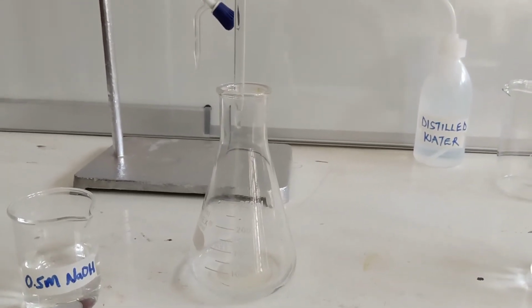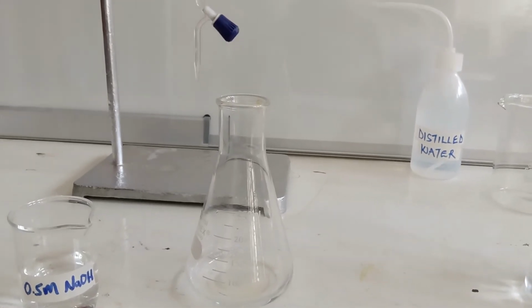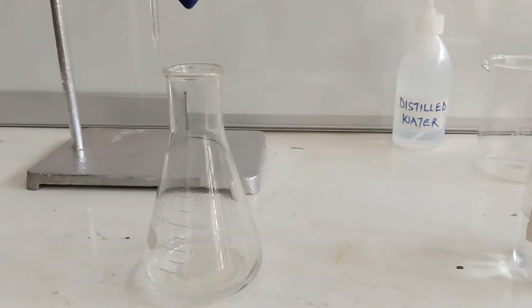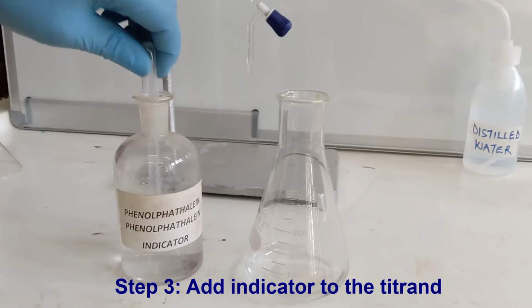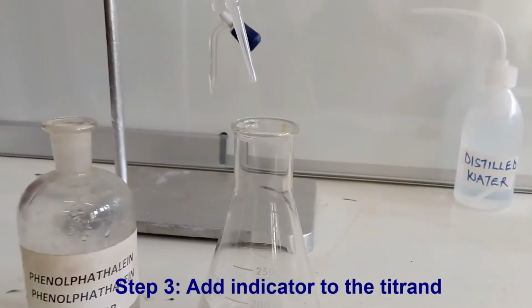Transfer the titrand to the flask, and do not blow the last drop of liquid that remains in the pipette. This is catered for in the volume of the pipette, and should never be put in the flask. Add 2 to 3 drops of the indicator to the titrand, and gently shake to mix.